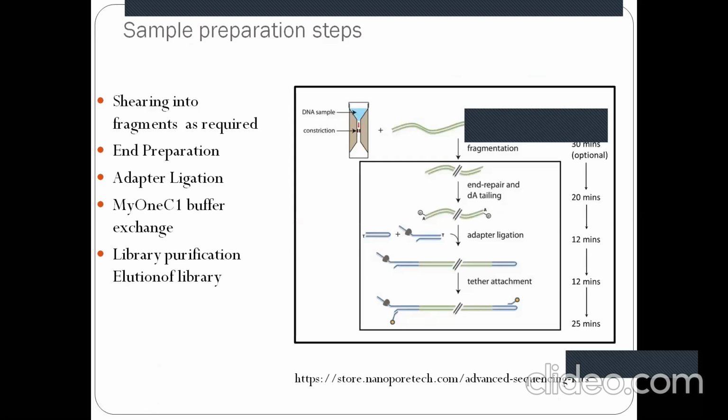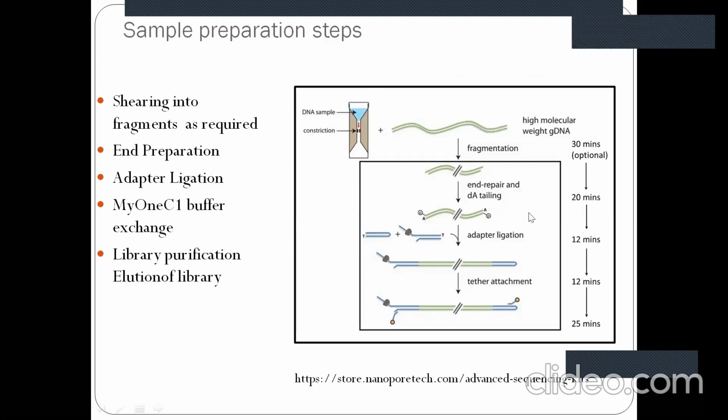So this is basically the entire chemistry. What happened? So why is this not basically working? So first thing is that this is your DNA. So what is the sample preparation?